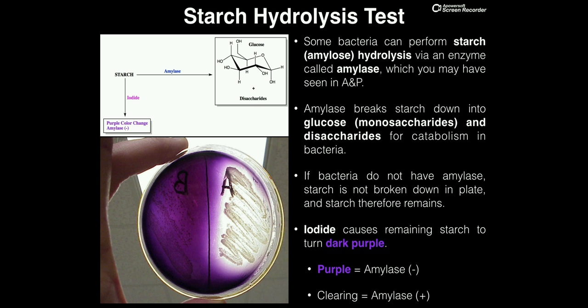What we do is plate two species of bacteria — one on each side of the plate. Typically, you take a marker on the back side of the plate and draw a line so you know where you're plating. On either side of that line, you have a different species of bacteria.